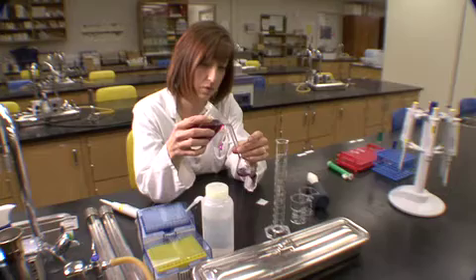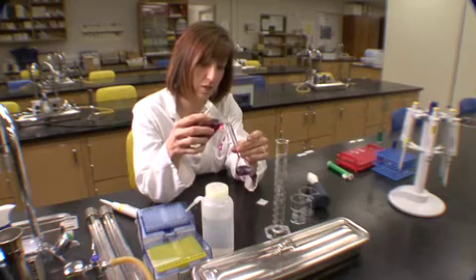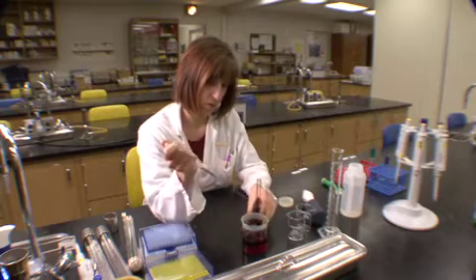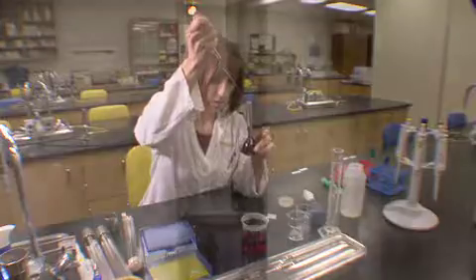Volumetric flasks are more accurate than graduated cylinders due to a narrower neck, but are less flexible as they are only marked for a single volume. If you have difficulty viewing the line or meniscus, you can try and place something of a contrasting color, such as a black piece of paper, on the other side of the glassware to make it more visible.